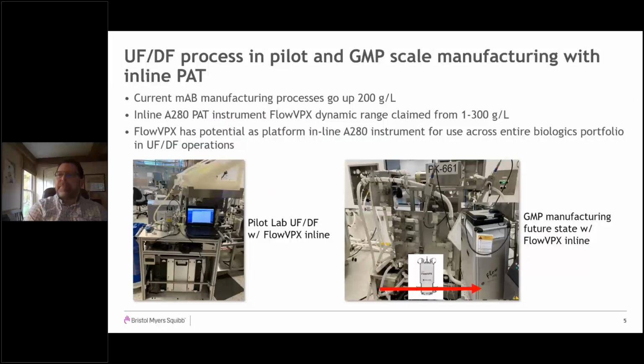Now we'll get a picture of what it looks like, not just as the cartoon, but how it looks in the laboratory. We have 3 different scales that I'm going to talk about today. One is bench scale, and I don't think I included any pictures of that. But suffice it to say, this VPX instrument that we're talking about is scalable.